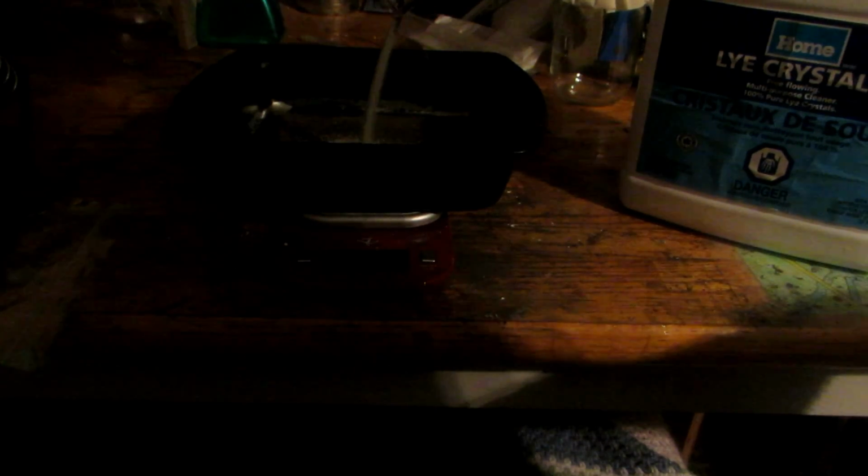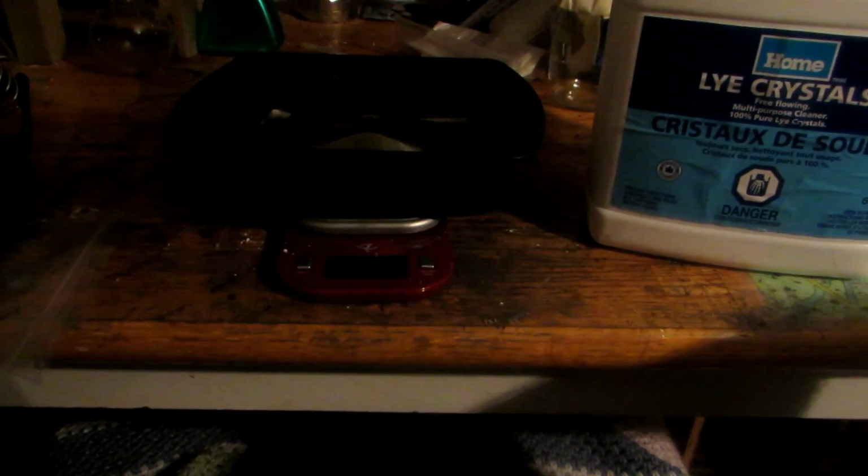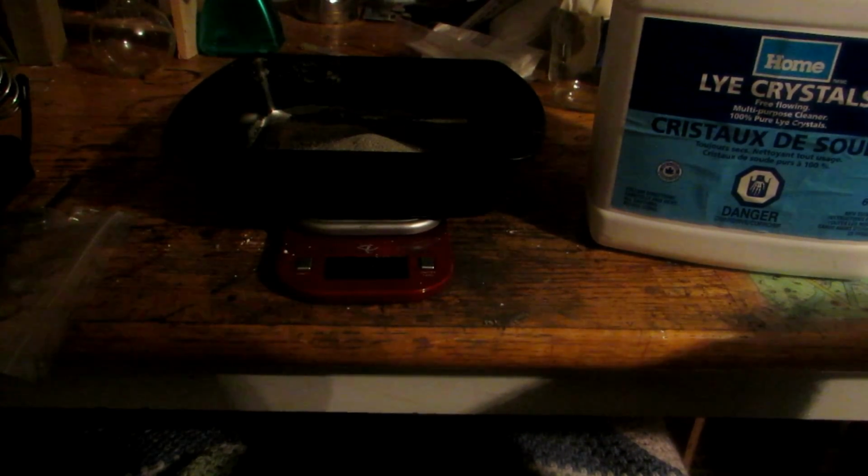You can buy several pounds of this for a fairly cheap price, and it's extremely useful. And you can probably find it at various different stores. It's not just as lye crystals, you can also find it as drain cleaner and various other sources. Anyhow, we simply need to turn on our scale and zero out the pan. To make this simple, we'll weigh out 100 grams of our nice dry sand, which means that we will have to weigh out 133 grams of our sodium hydroxide. So, I'll weigh out those two things and put them together and show you what's happening next.